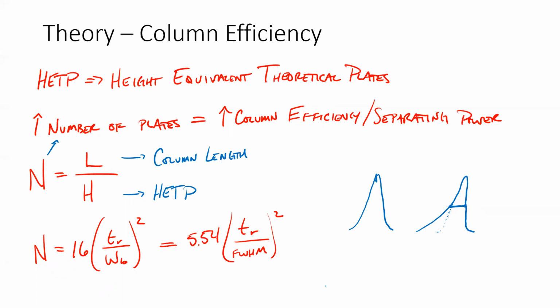The other concern that we sometimes have is that if your baseline is drifting, it could be that it looks like that, and it doesn't come all the way back down to the baseline, and if this is your baseline. Or one last example, if you're not very well resolved, what's the baseline width for that first peak versus that second peak, right?